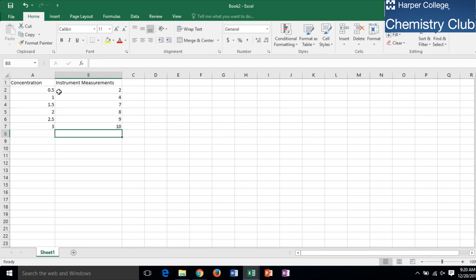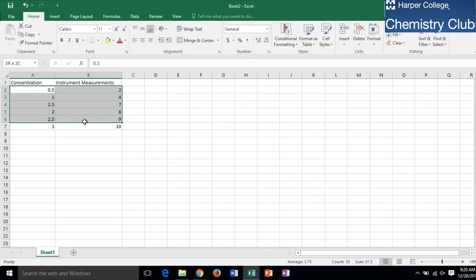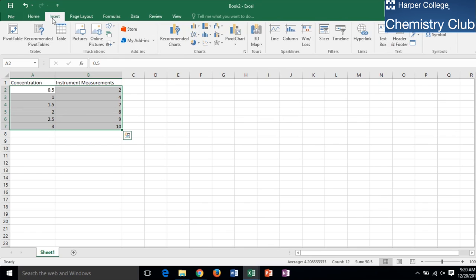Next, create a scatterplot. Do this by selecting your data and then click the Insert tab at the top left-hand corner of the screen. In the charts box, select the graph where no points are connected.